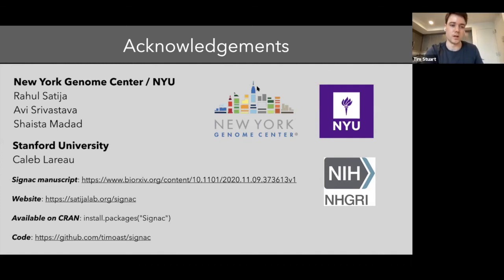Yeah, I think it could be useful. One of the challenges is that when you're just looking at raw counts, there are different numbers of cells in different populations, and when you subtract one value from the other, you'd have to correct for that, which, to be fair, we already do when creating these coverage plots. I think it's potentially an interesting thing to look at, particularly visually, if you want to quickly narrow in on things that are different between different groups. Sure, yeah. Great, thanks.